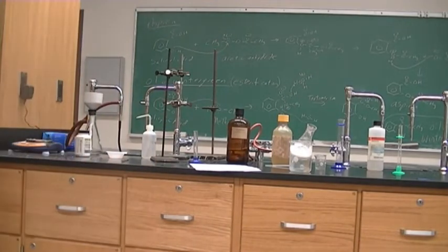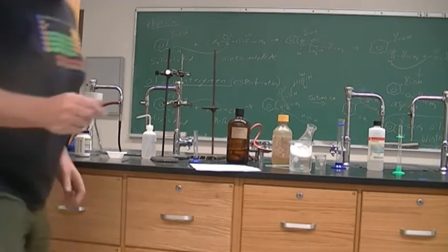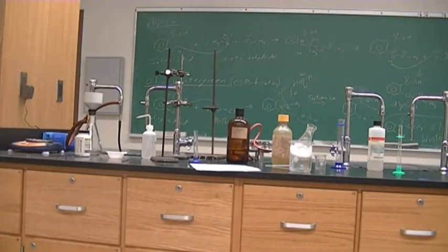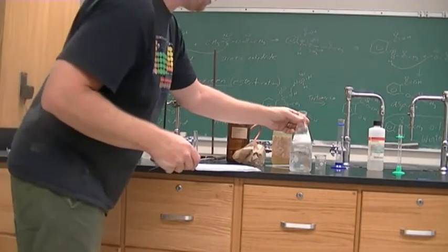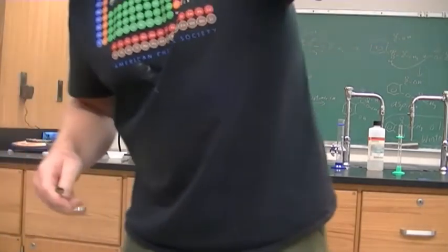We'll need a spatula to get some of this solid out. It doesn't move at all.